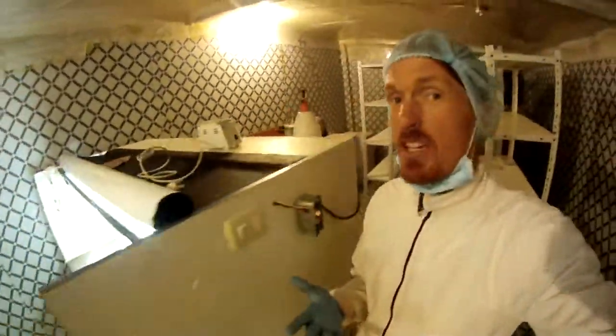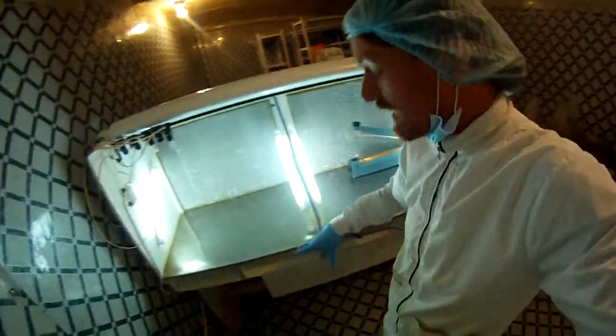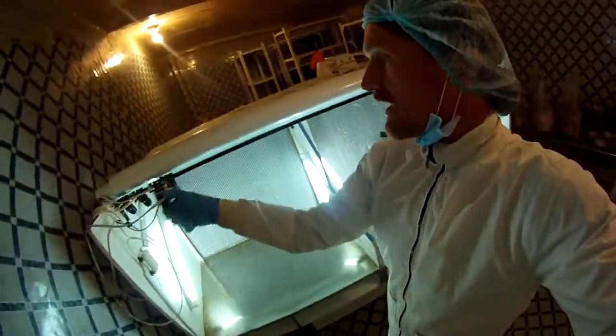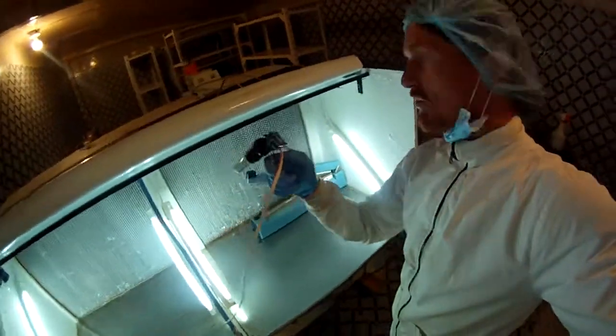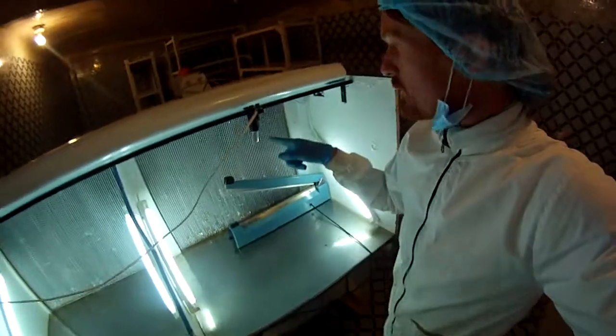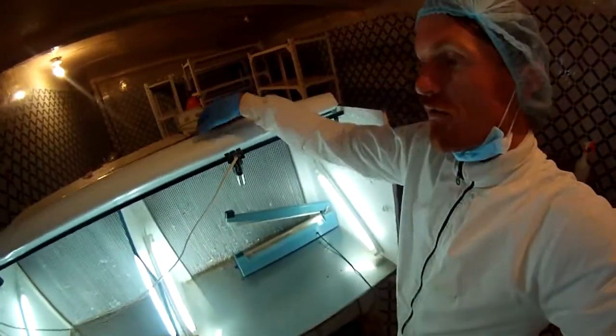I keep this place clean. When I do work, I make sure this table leaves clean. I clean the floor and then I go to the nth degree - I have a UV lighting system. It goes up here on a timer and cycles on for an hour every night to sterilize my workspace.